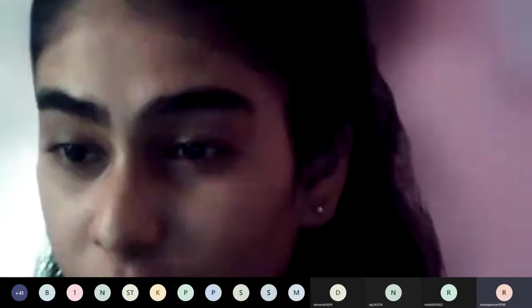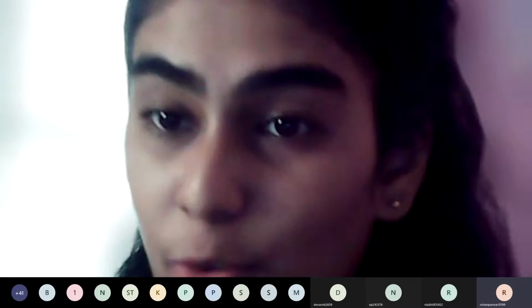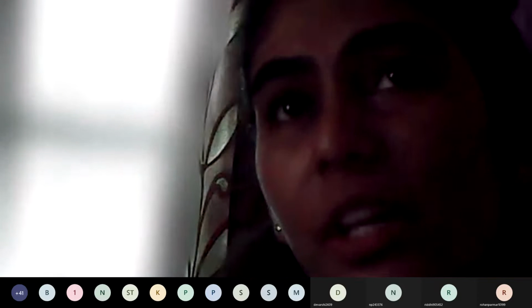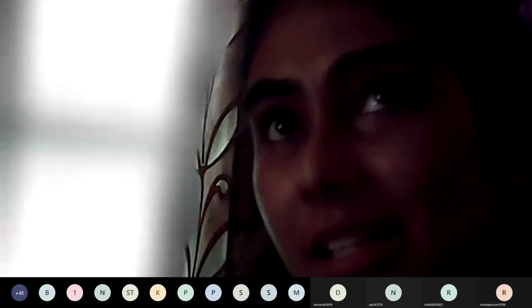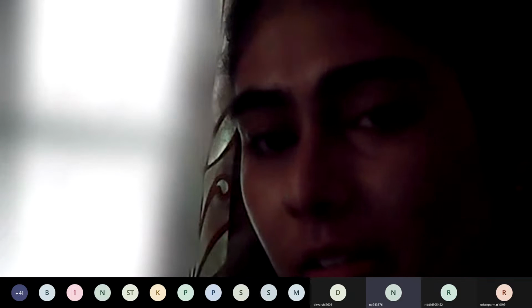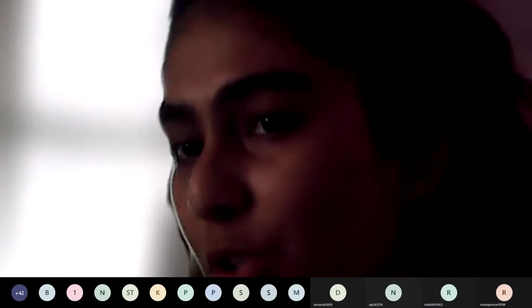Silica gel with thin plates was the stationary phase. Okay, good. स्टेशनरी फेज आपका सिलिका जेल था, तो आपने जो स्टेशनरी फेज लिया था, was it an aluminium sheet or was it a glass slide on which you poured silica gel and made it uniform? Aluminum sheet. Okay, fine. You did it with an aluminium sheet.